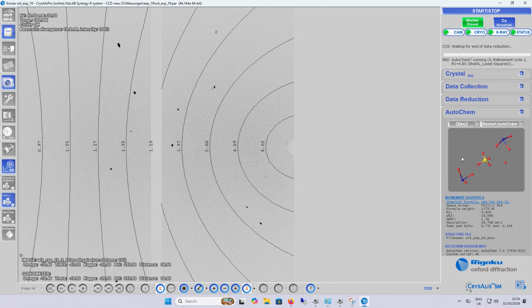Okay, I think it finished collecting the data. So we only did 3 runs.